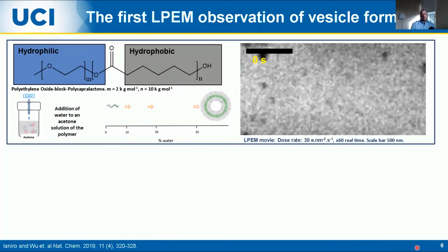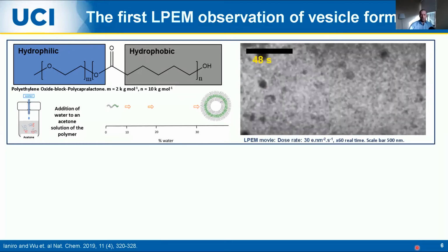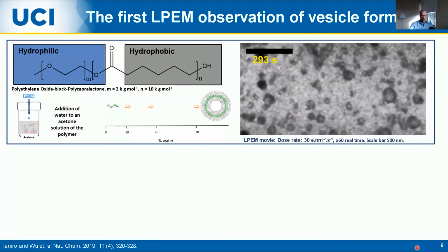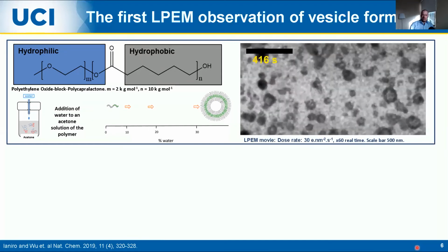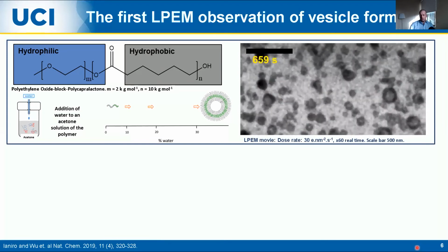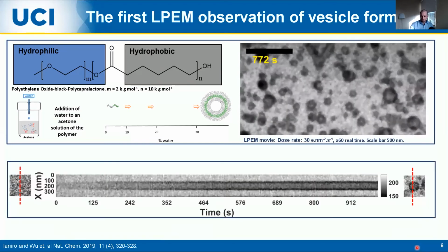So the first story I want to tell you about began when I was doing some liquid phase EM studies on vesicle formation. Here I'm going to show a movie of polymer vesicles forming with liquid phase electron microscopy. And when I was investigating this movie, we found something that we didn't expect to see.